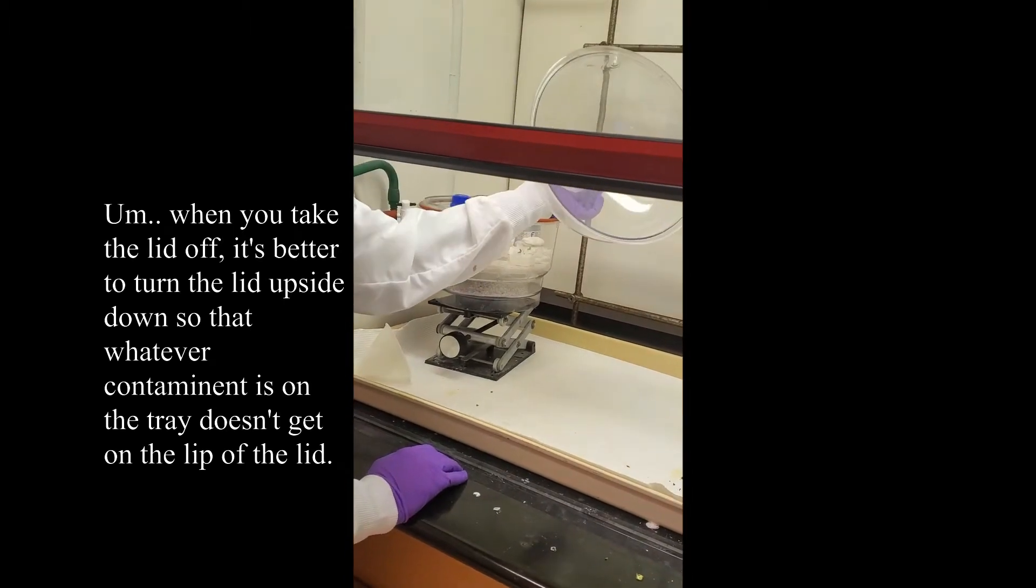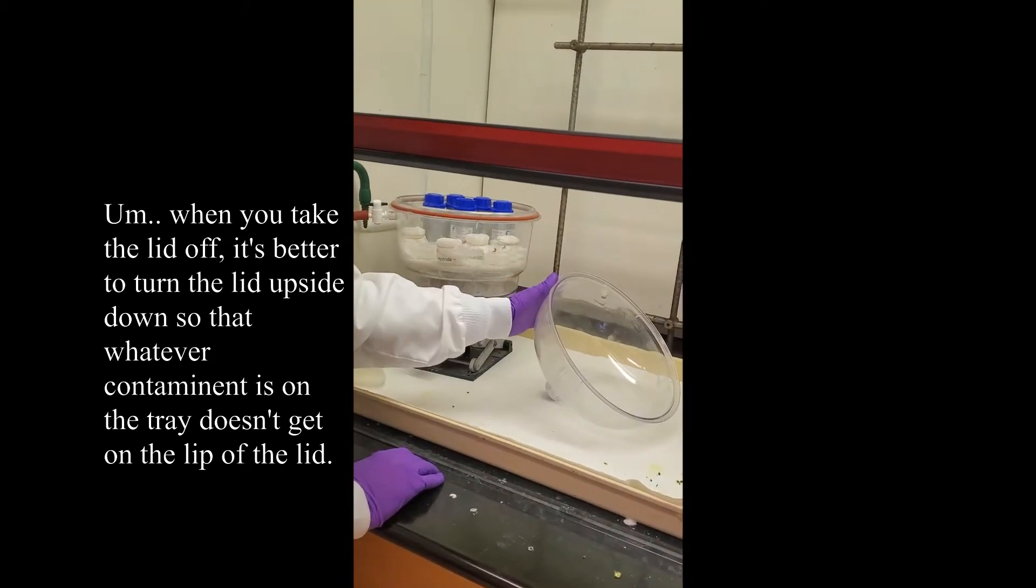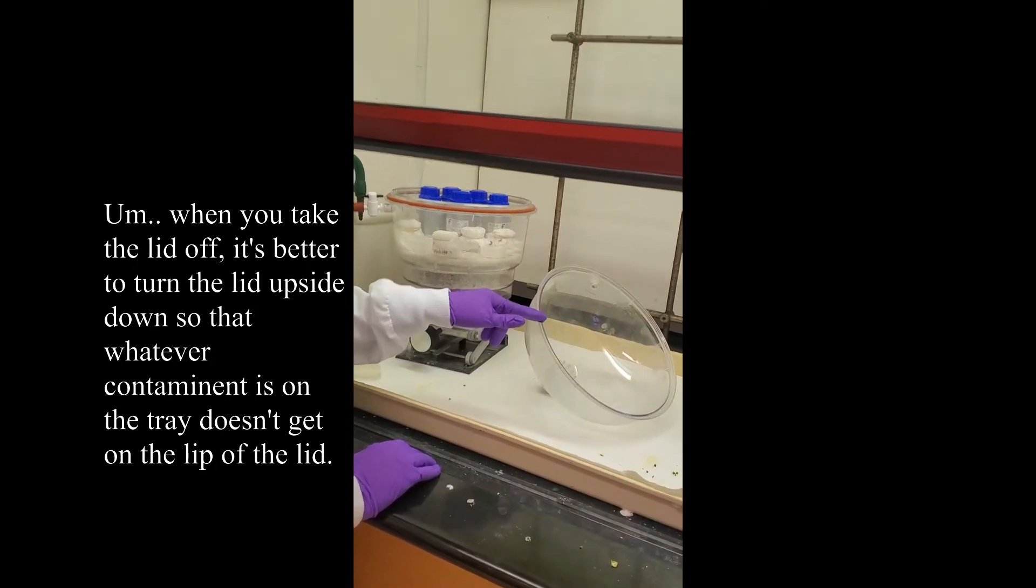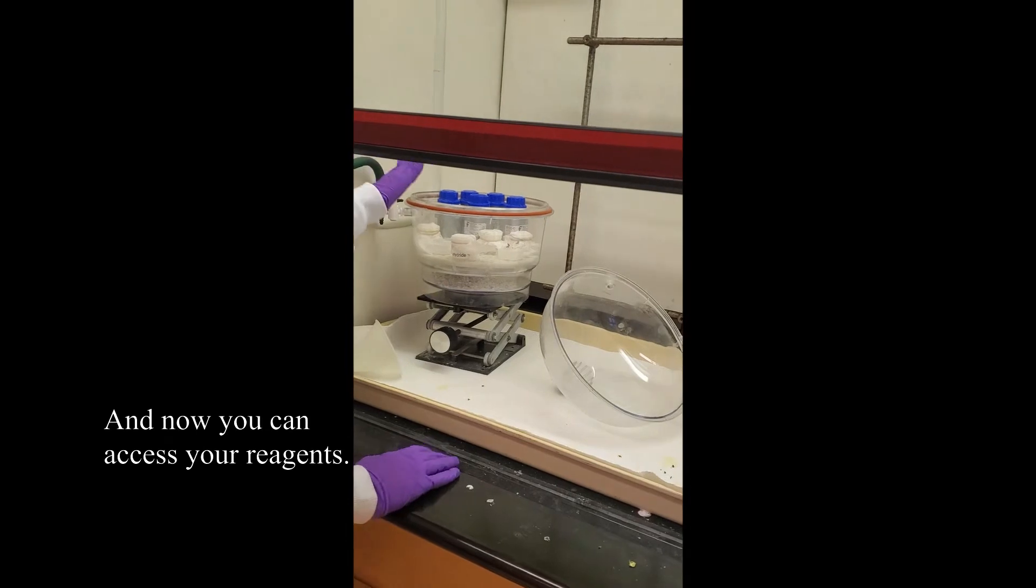When you take the lid off, it's better to turn the lid upside down so that whatever contaminant is on the tray doesn't get on the lip of the lid. And now you can access your reagents.